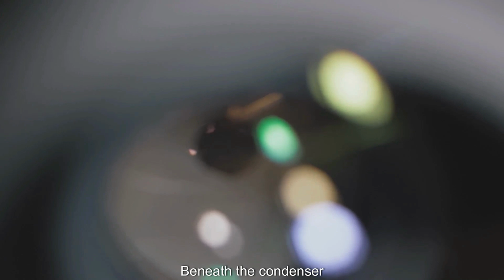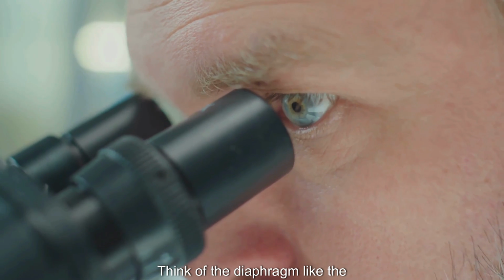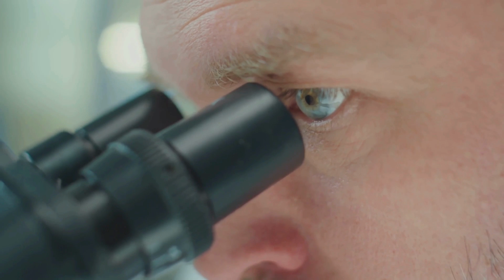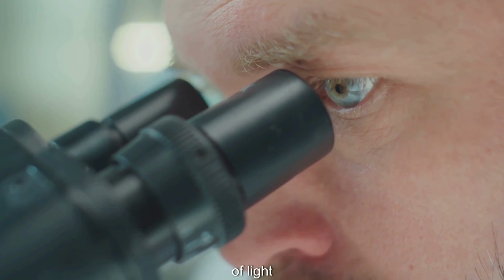Beneath the condenser, you will find a small lever. This lever controls the diaphragm. Think of the diaphragm like the pupil of your eye. It can open to let in more light, or close to reduce the amount of light.